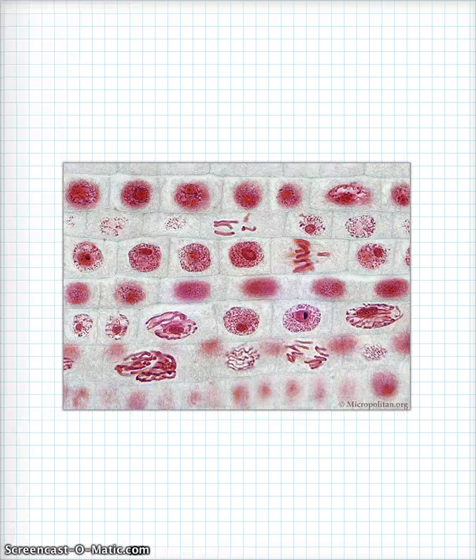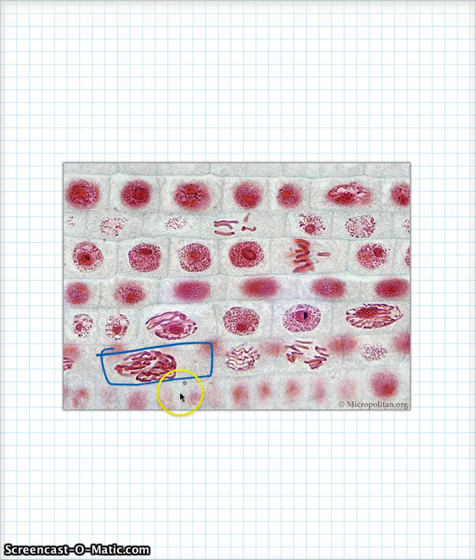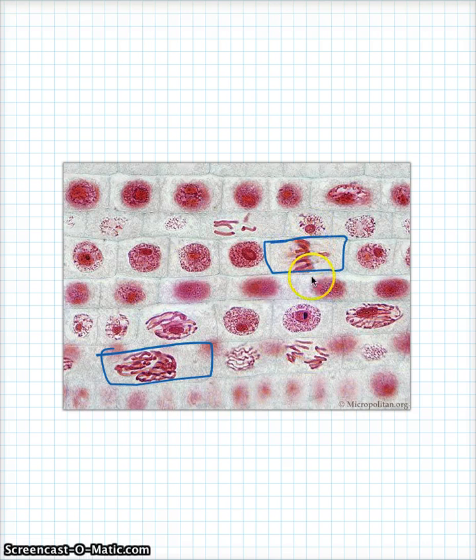All right, here's some more. More plant cells. Cell walls. Look at this big, weird-looking thing. I would call that prophase because I see chromosomes are sort of in the middle. They're not really organized, but they're just sort of like in a blob in the center of the cell. This one, however, really nice and organized and aligned. That's definitely metaphase.